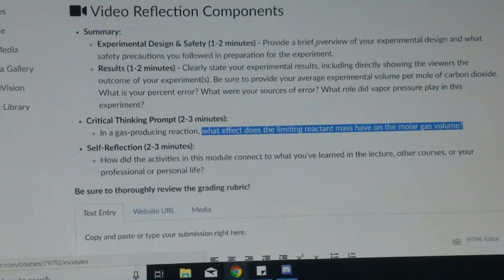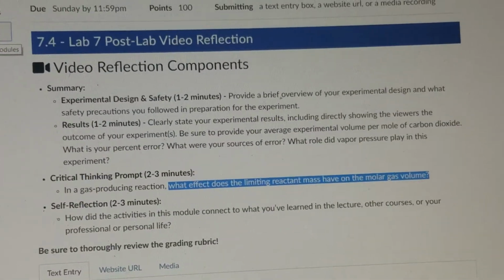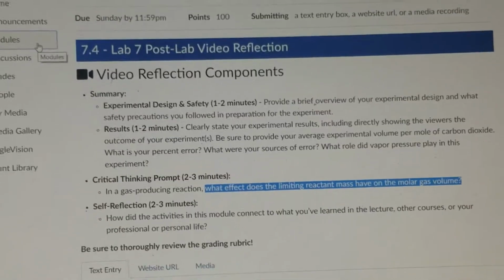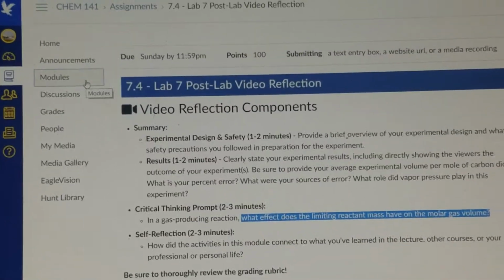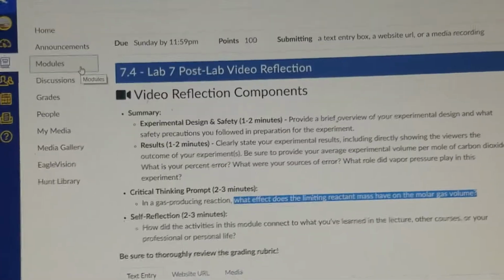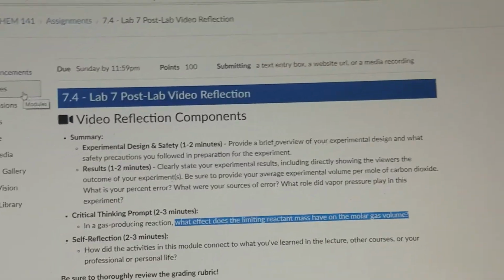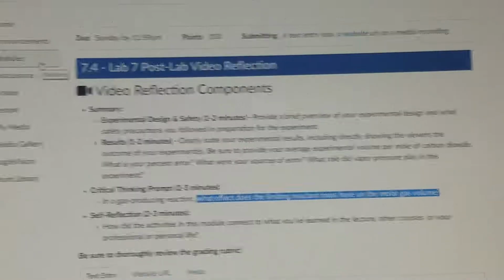And to sum up the sources of error, the first one would be how deep you put the 6-inch rigid tube in the water, because based on that, the amount of water displaced would be accurate. Second would be the human constraint of putting the cork on top of flask 1, so some of the gases might escape. So these are the two sources of error in this experiment.